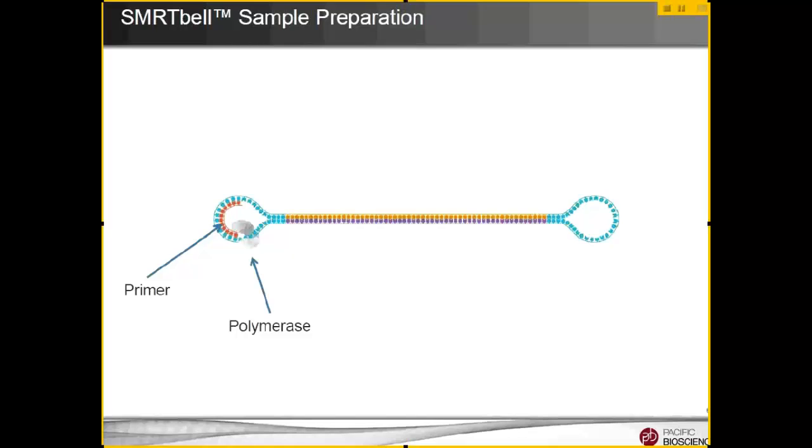Another thing to note here is that while the polymerase always starts here, the actual sequencing run where they are detecting which base pairs are being incorporated does not start at the same time. They have some internal issues with their chemistry, where often things have to ramp up, and you're not going to be sequencing until you're here somewhere.